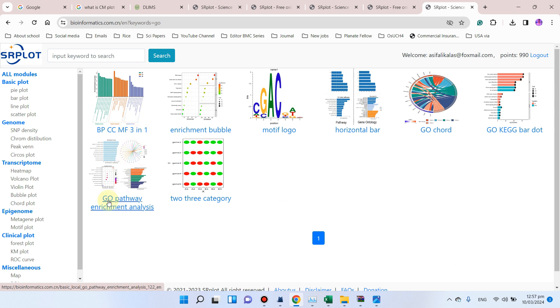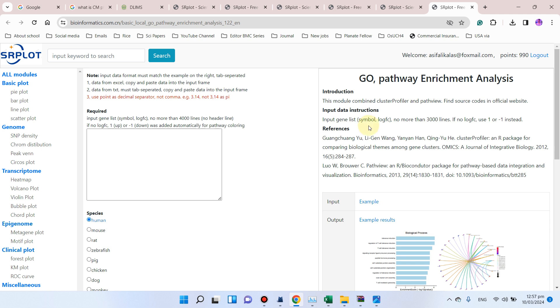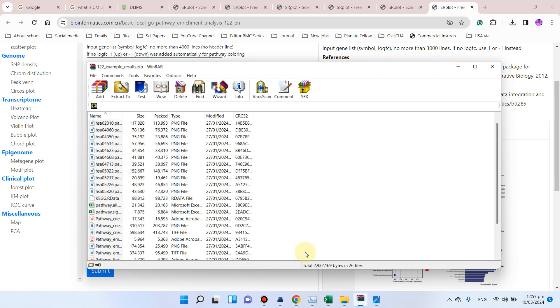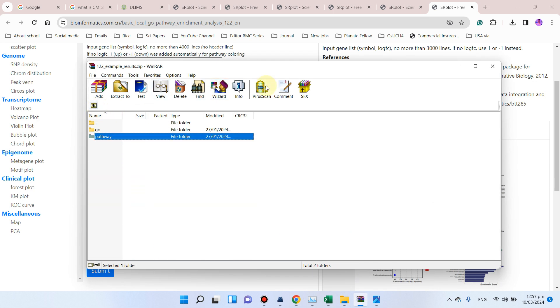And here you can write simply GO. You can see here are the different modules for gene enrichment analysis. Here we have Gene Ontology Pathway Enrichment Analysis, so you can click on this.